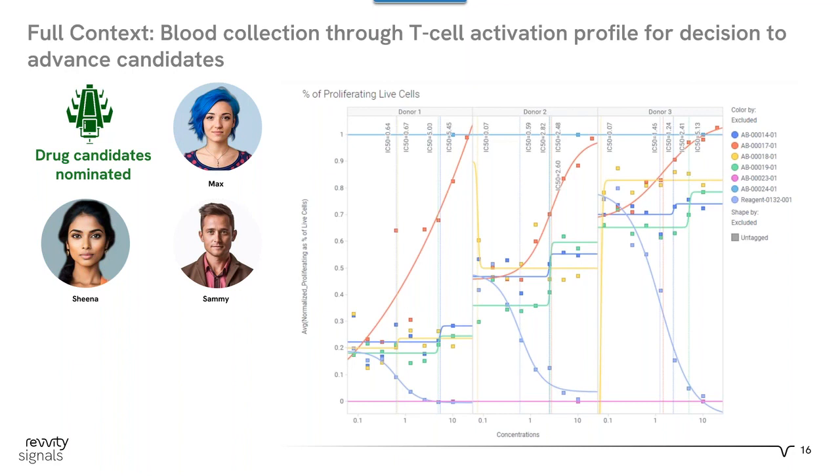So, we're making these naive T cells from blood, gathering the necessary data context, performing a drug candidate screen via FACS, and observing those activation profiles, and consistently and easily stepping through that secondary analysis for the report generation. And then again, pushing that back into the notebook for the final decision. So with this last slide, I'll conclude my part of the presentation and turn it over to Diana to take us through some analysis and then the Q&A section of our Connect.